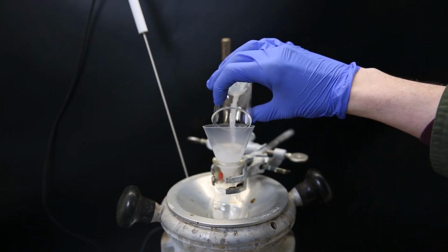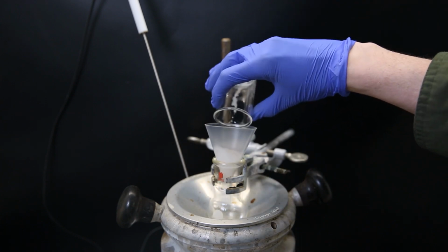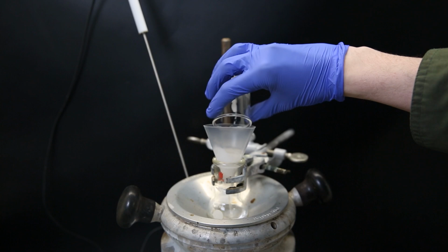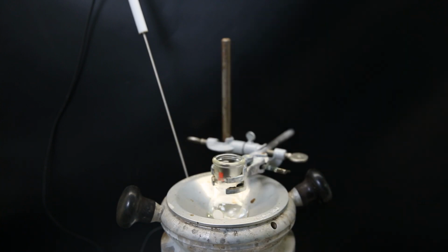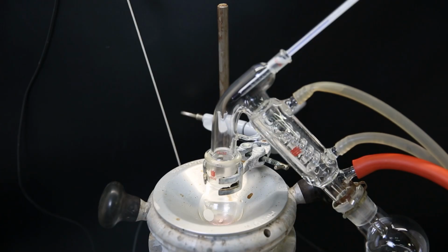I then set up a pre-weighed flask in a heating mantle with a funnel that is plugged with some cotton, and I filter the dried pentane layer through. I then wash the beaker and filter with a bunch more pentane to wash everything out and down. Now I set this up for short path vacuum distillation and remove all of the pentane. When that is done, a light pink liquid is left behind, which is bicyclo-1,1,1-pentylphenyl sulfide.